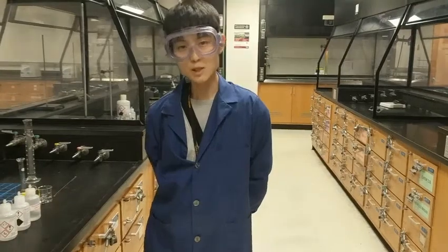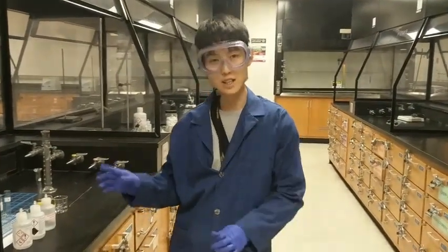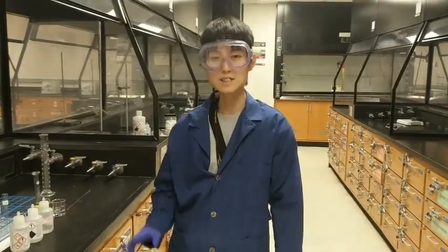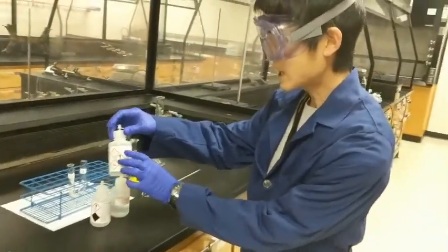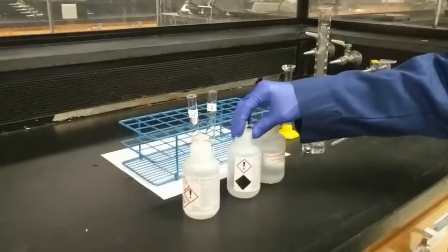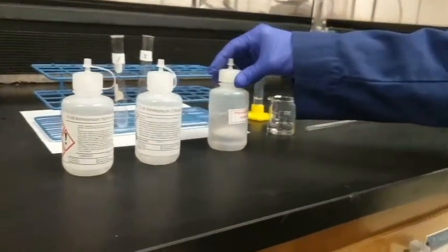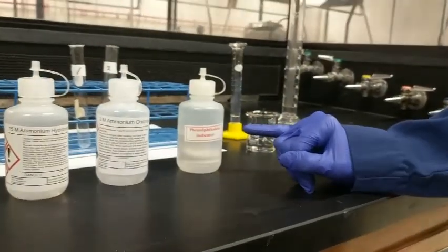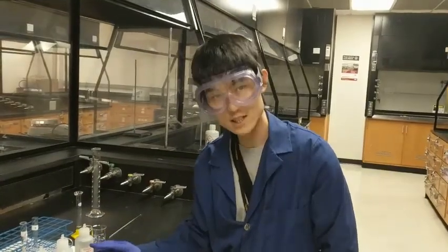Okay, in the third part of the experiment, we are going to control the ionization of the weak base ammonium hydroxide by adding its conjugate acid. So we have 15 molar ammonium hydroxide solution, 2 molar ammonium chloride solution, and a phenolphthalein indicator. All the solutions are colorless, okay?